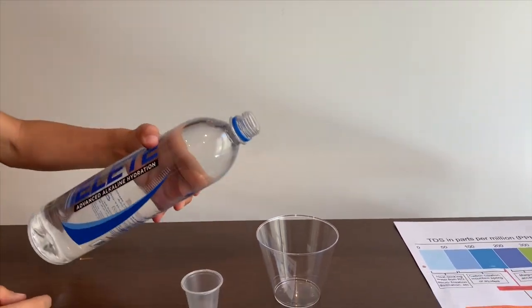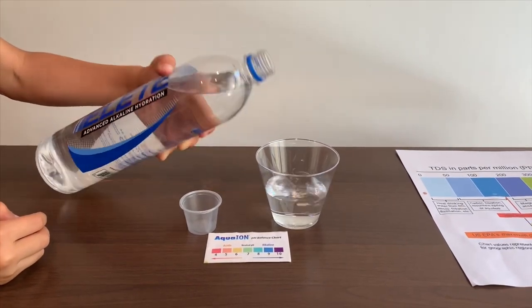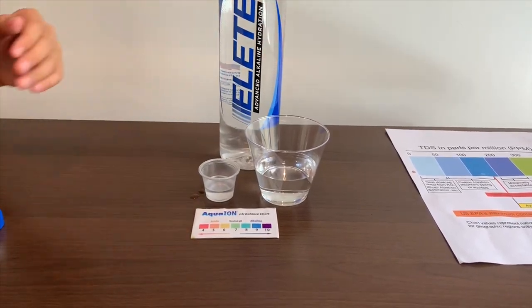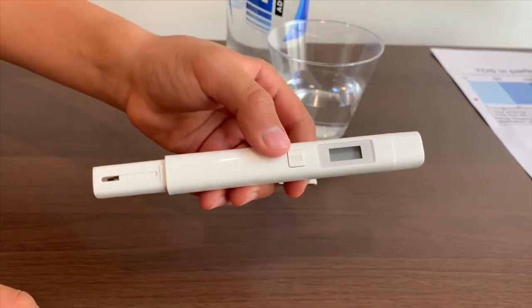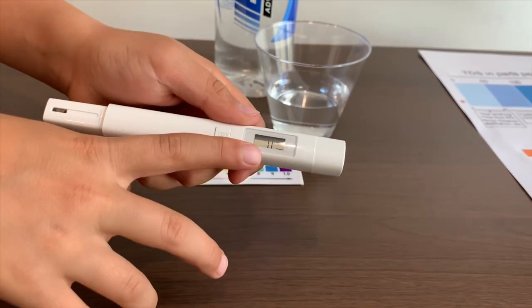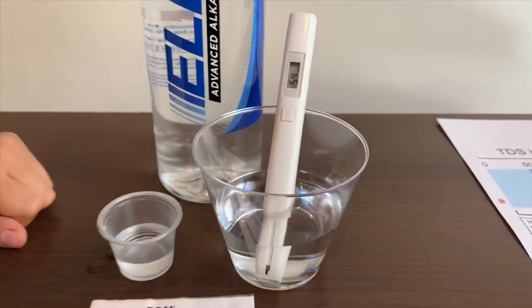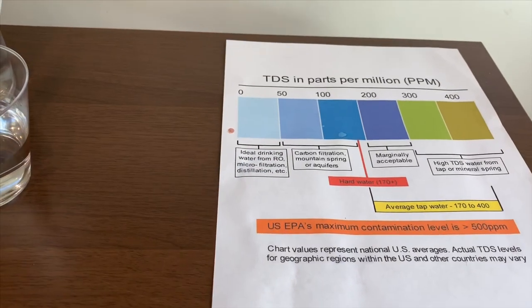Let's pour some water in. First, let's test the TDS level. If you want to buy this TDS tester, check the link down below. Turn on the TDS tester, make sure it says 0 and put it in. 54 — that is carbon filtration mountain spring water.